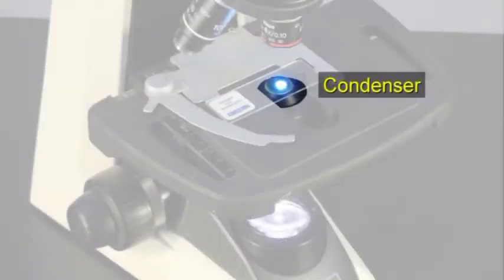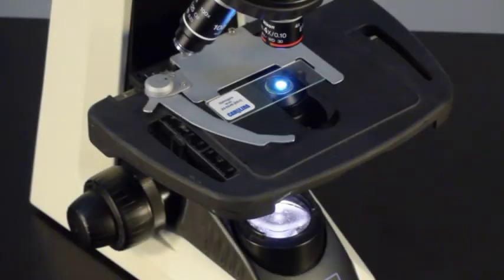The condenser is a small lens mounted on top of the iris diaphragm. It concentrates or condenses the light into a small, intense beam to shine through the slide.